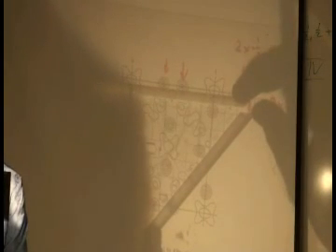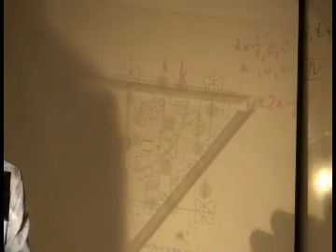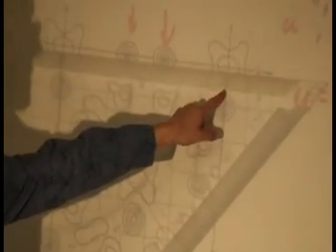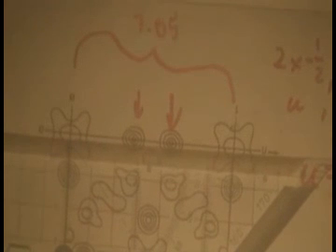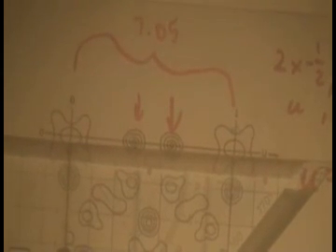And remember, we give things as fractional coordinates, right? So one of the things we measure is the total distance between 2 unit cell axes on this drawing. And that's actually 7 centimeters, so it's about 7.05. And then we have to measure to one of those peaks.